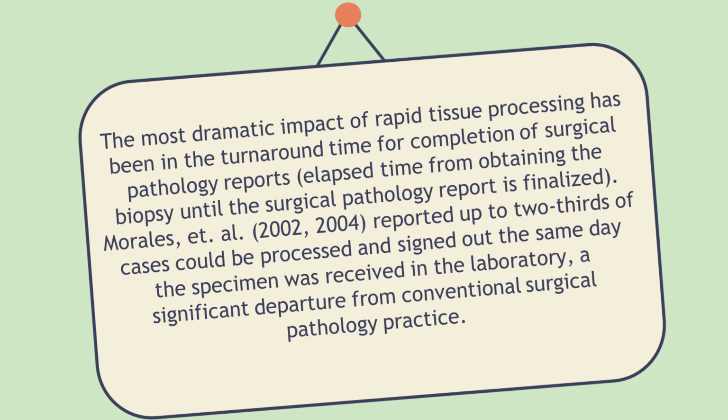So rapid tissue processing is very convenient. Of course, with conventional tissue processing, we still have to wait for several days before the tissue section will be completed, but with rapid tissue processing, it can do the same day turnaround time, which is very convenient.